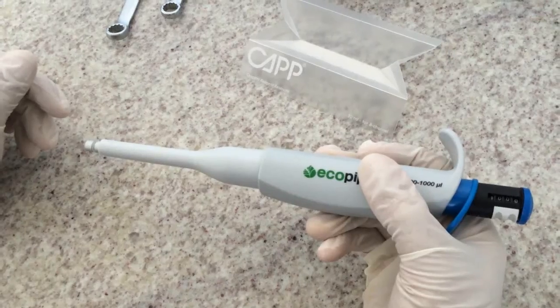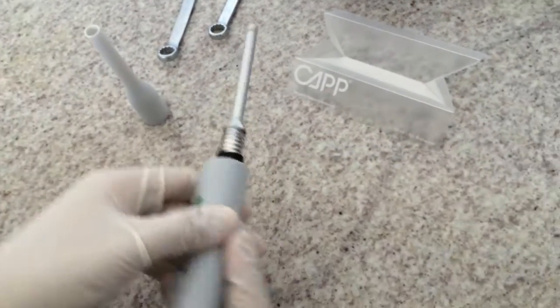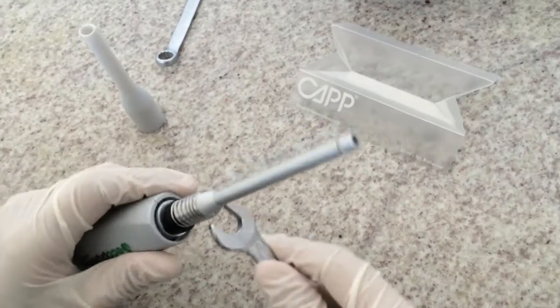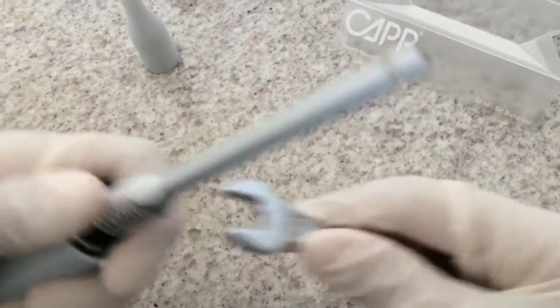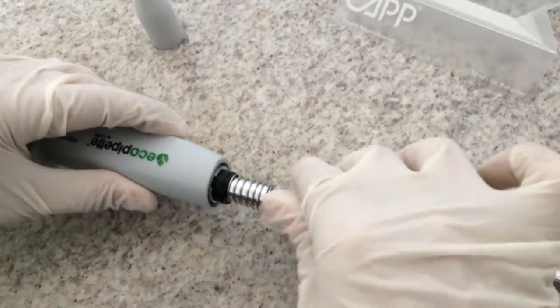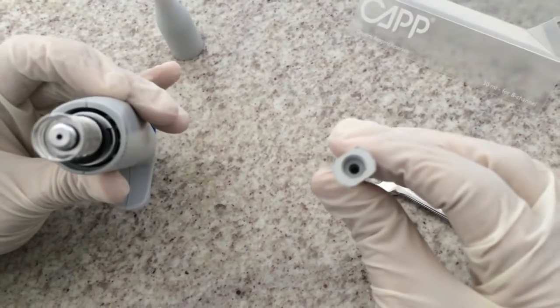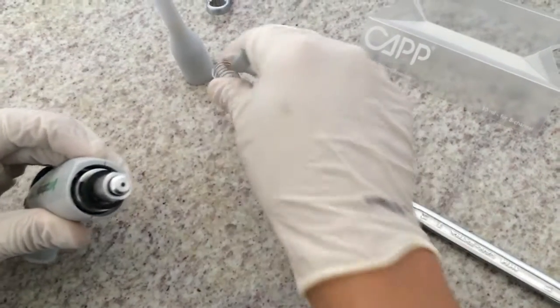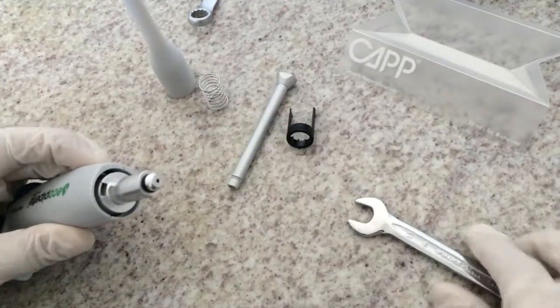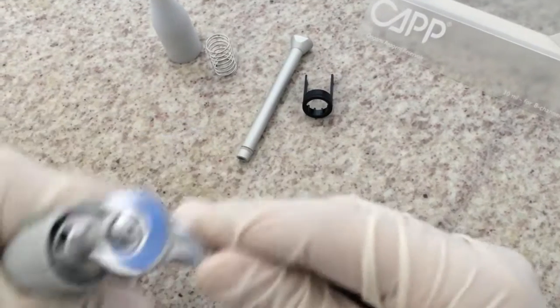Take the tip ejector off the pipette and unscrew the tip cone using an 11 mm wrench tool. Check if the tip cone or bottom part seems to be contaminated. Then you can again use an 11 mm wrench tool and disassemble the bottom part.